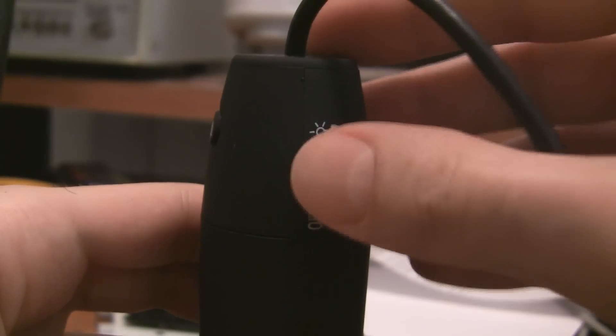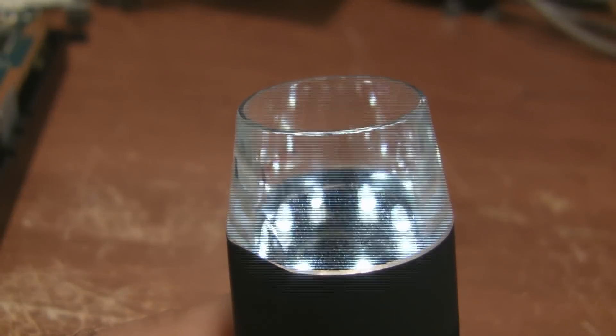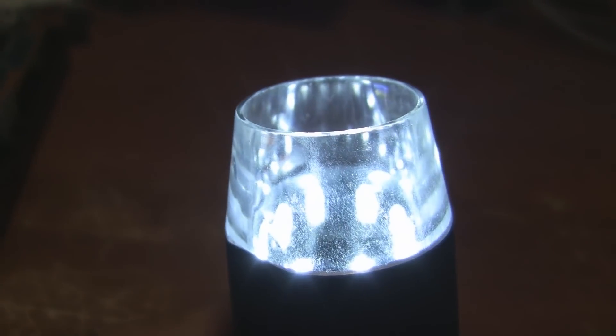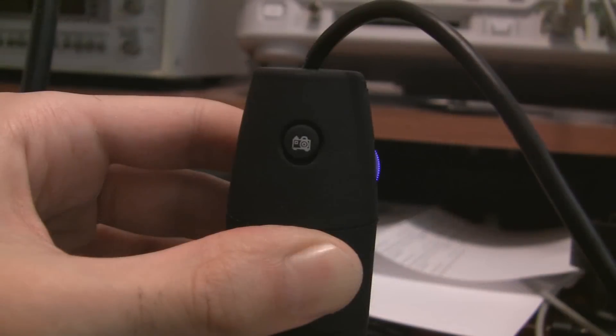Let's start with a quick tour. You turn the microscope on with this dial over here, and the dial also controls the LED lighting. You adjust the focus and magnification with this dial, and you can also take a picture with this button on the side.